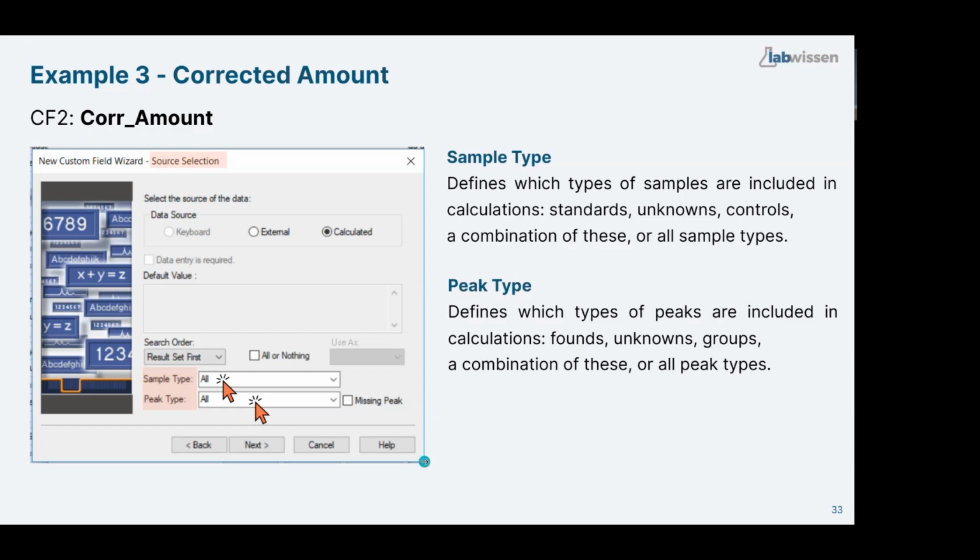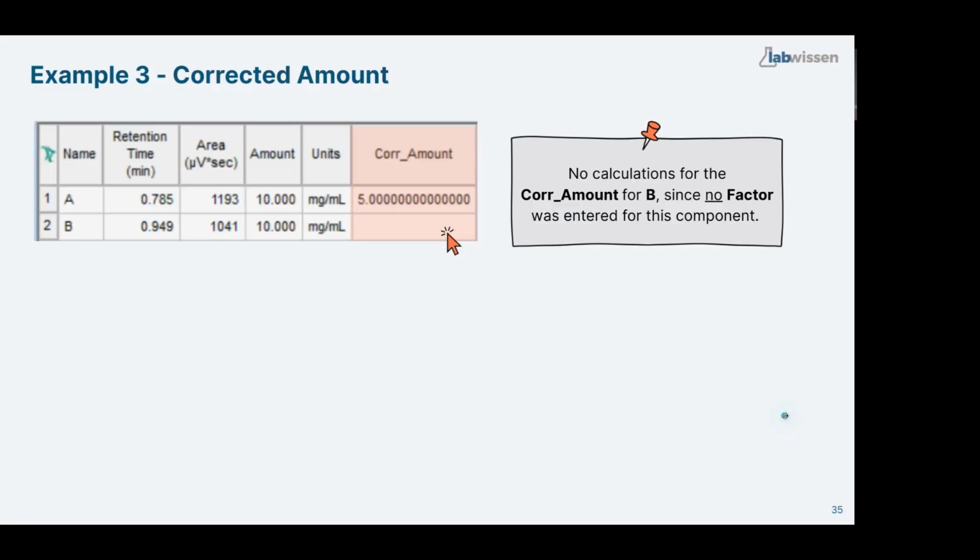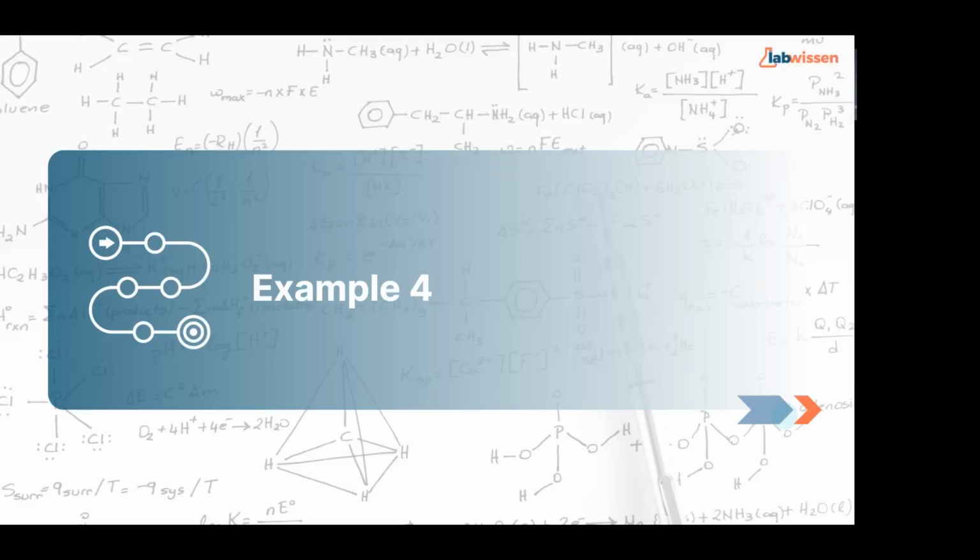If you want to do calculations for missing peaks, yeah, it's a bit funny. So, we are now at example number 4. I'll drink some water now, and you have time to put your questions in the Q&A section.